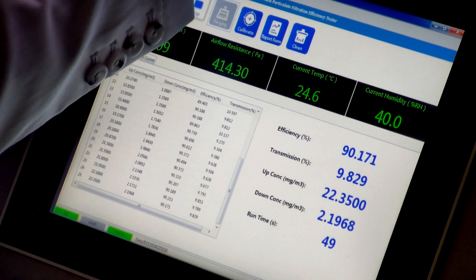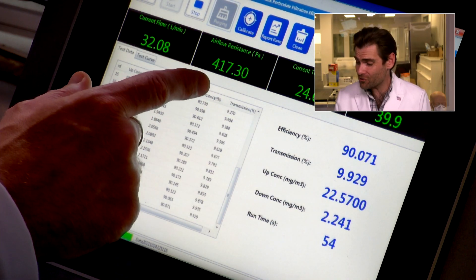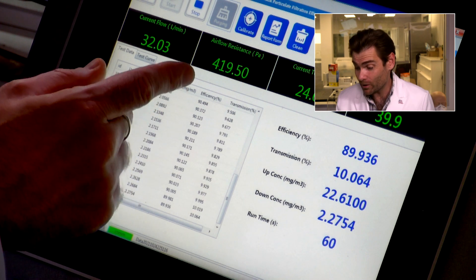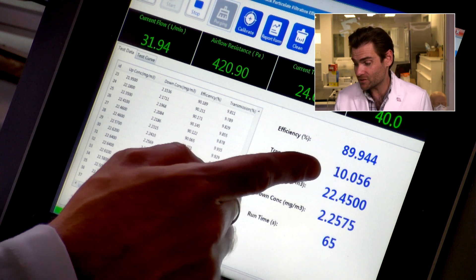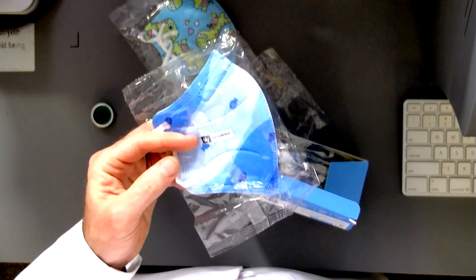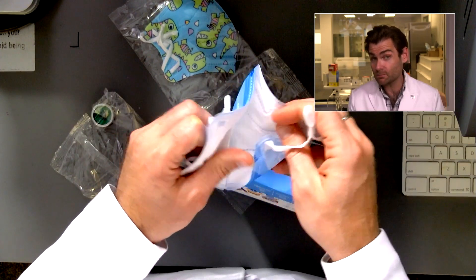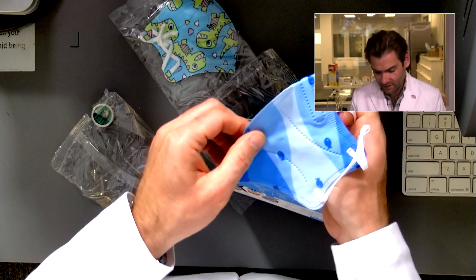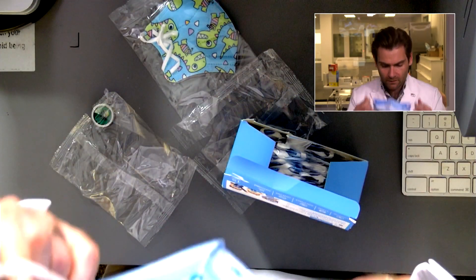I just can't wait to show you. 417 — the limit this machine can record is 600. So we are popping up against the limit of what this machine can do, with efficiency under 90%. They're just not making it. It does look really, really nice though. So if you just care about fashion for your kid, or maybe breathability isn't a priority, physically this might be a good mask for you. It looks and feels like actual fabric, and the printing is beautiful.